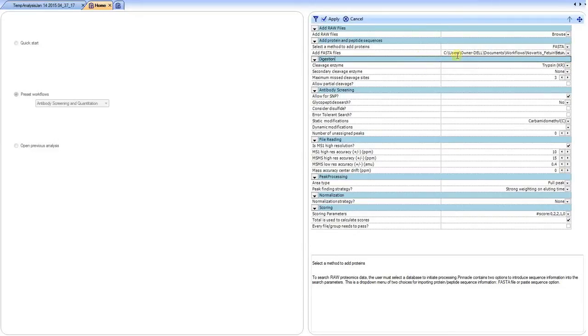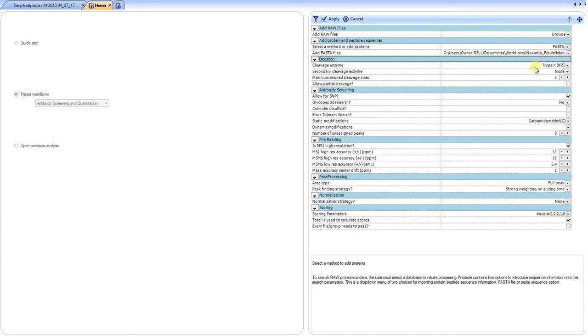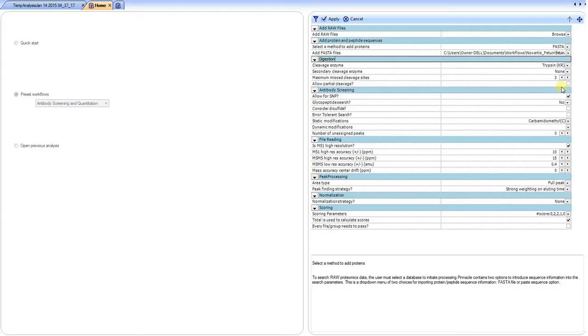Following the selection of the raw file and the knowledge base from which to search the raw data, you would specify your digestion enzyme, so if there's a primary or secondary, cleavage allowances, and if you want to search for partial cleavage.